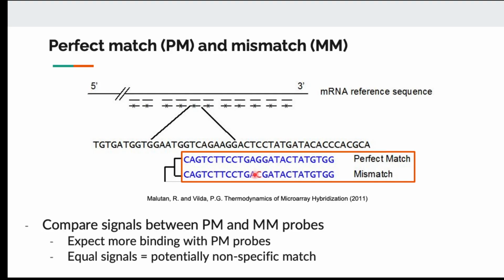I'm not going into the specific formula for it, but just to give you an idea that when we have a lot of space on the microarray, we can design probes for different tasks. So probes for measuring the expression, and probes to control and adjust the measurement.